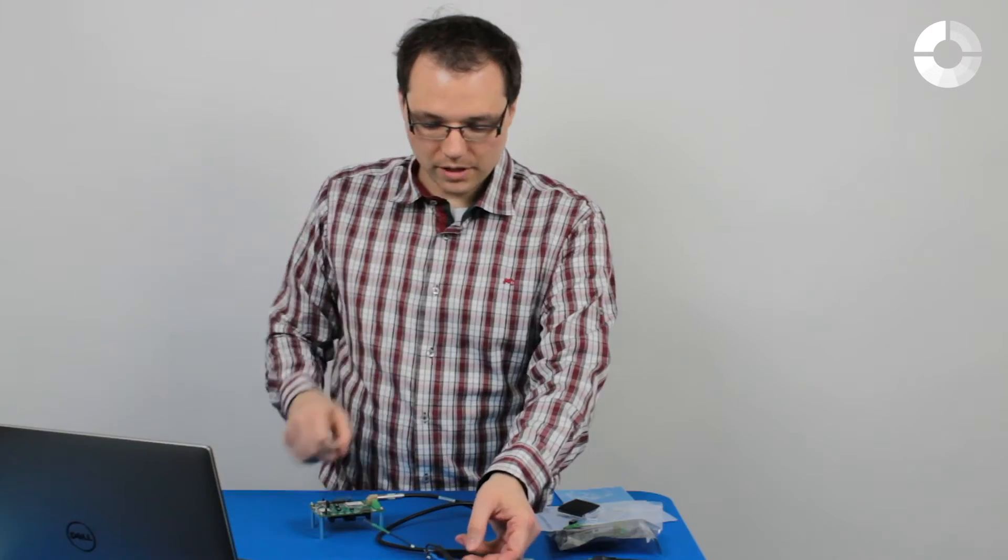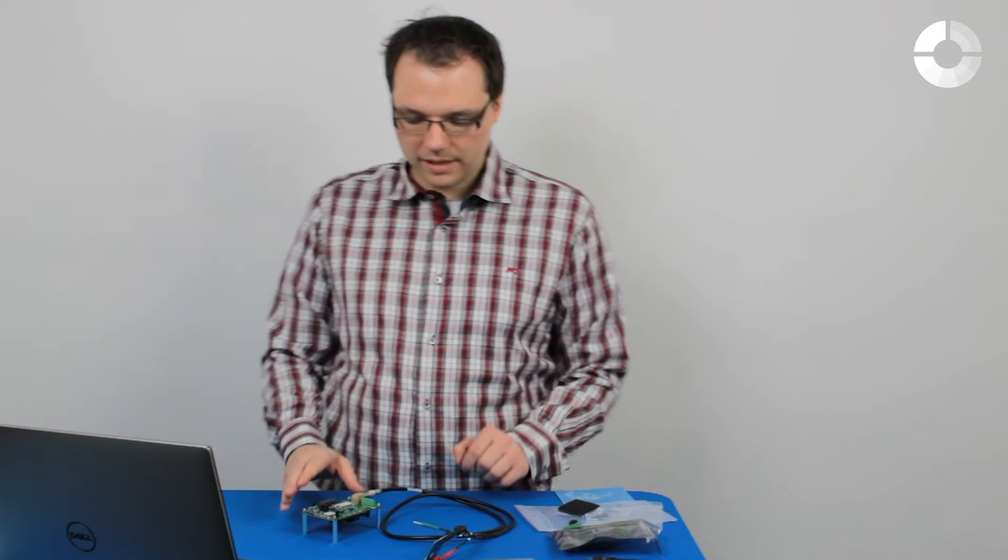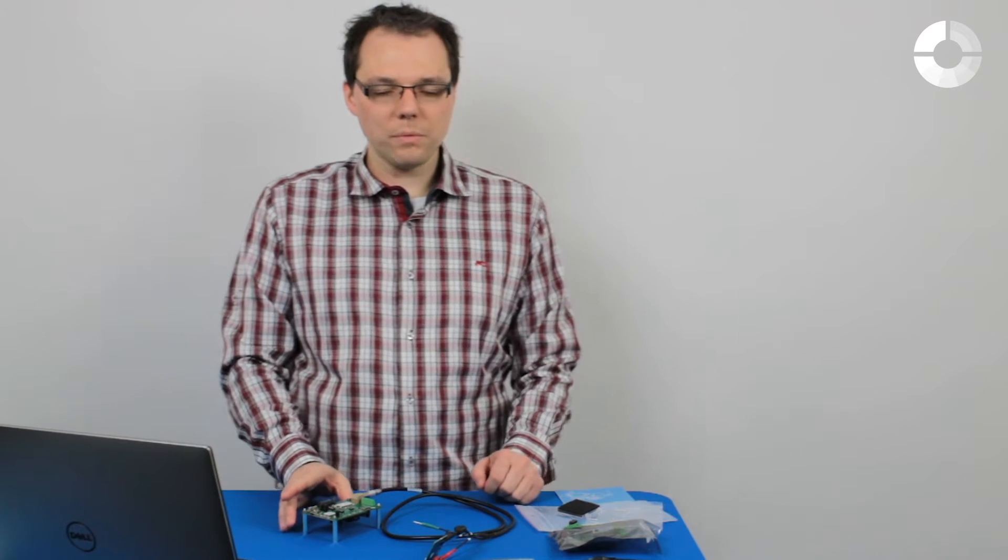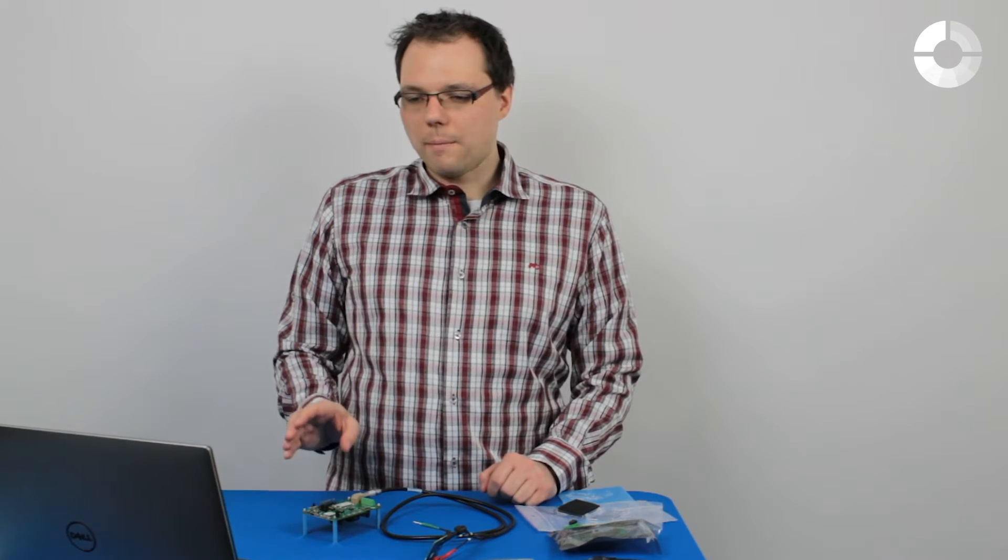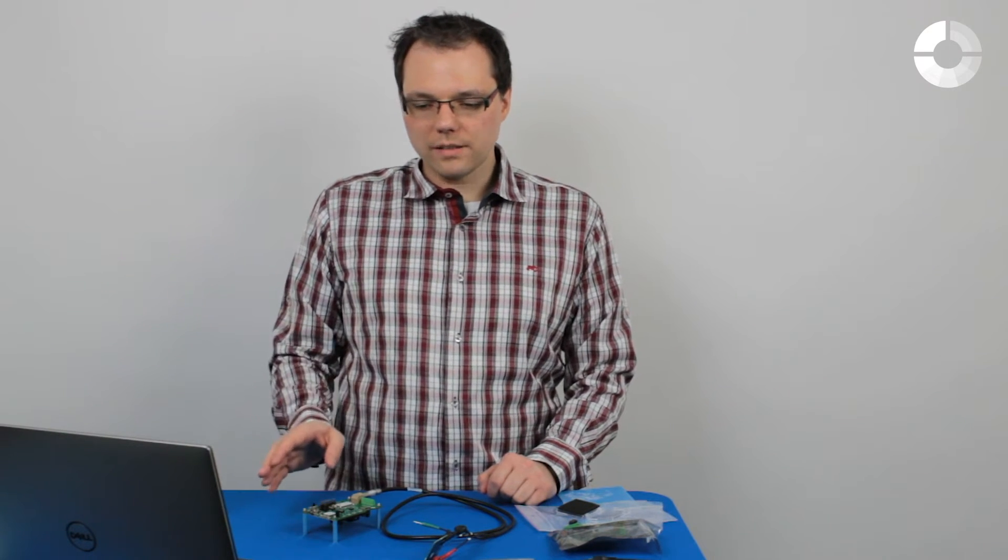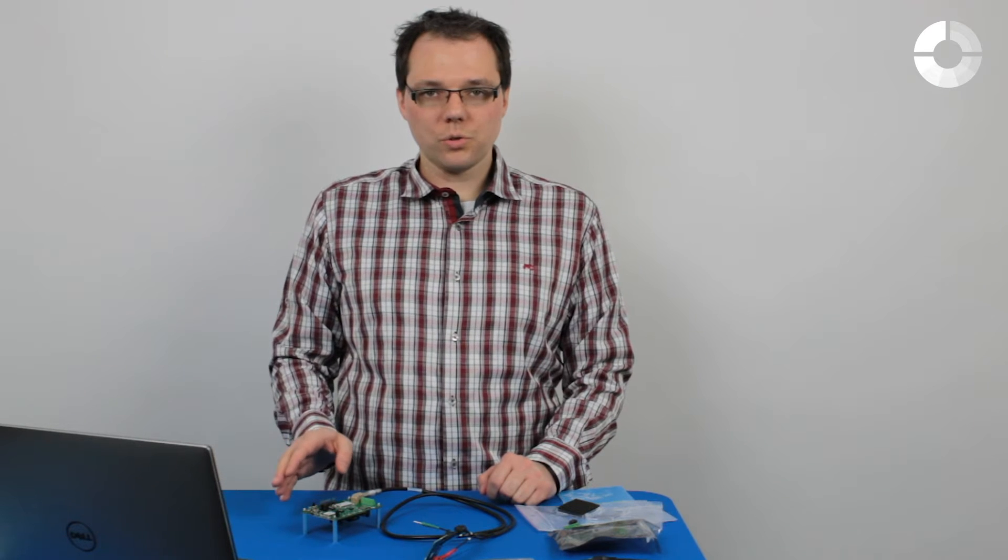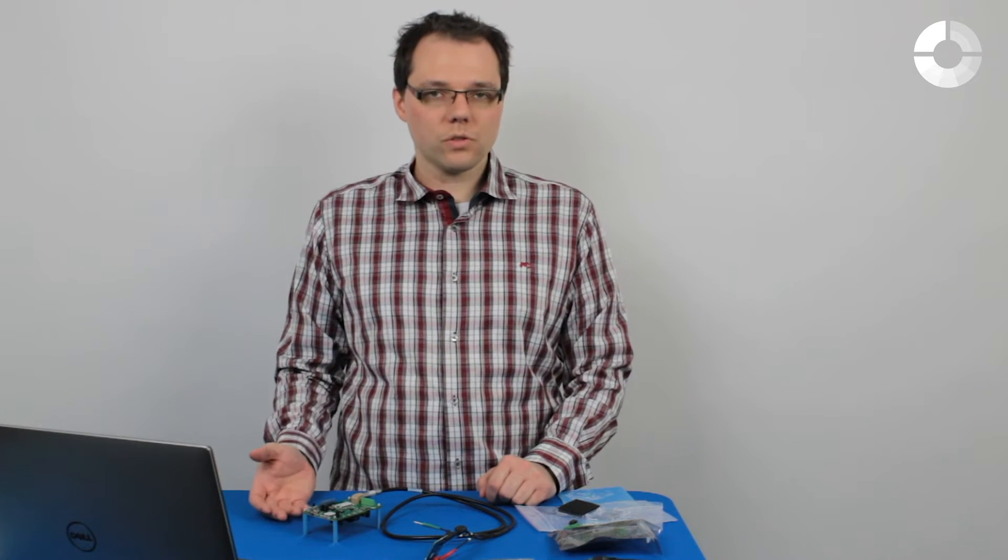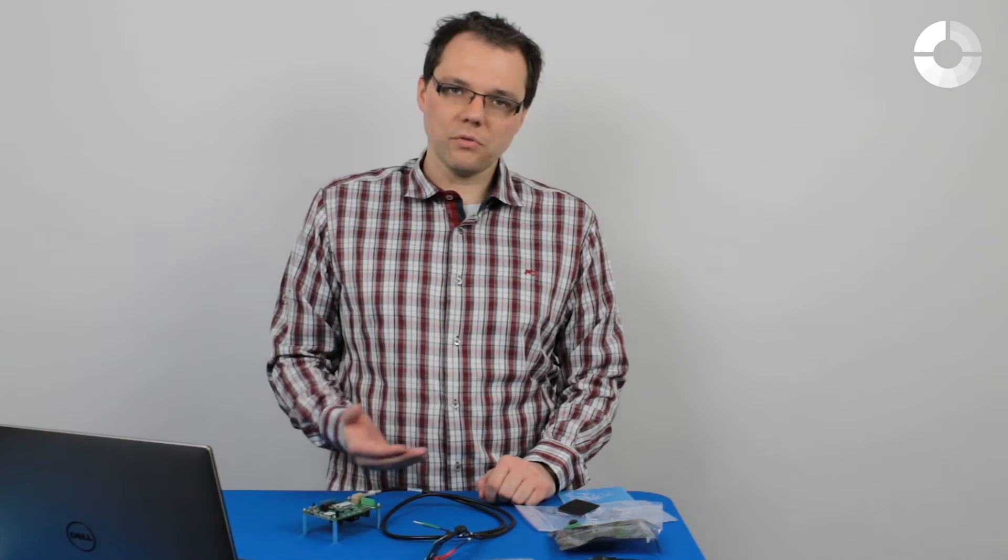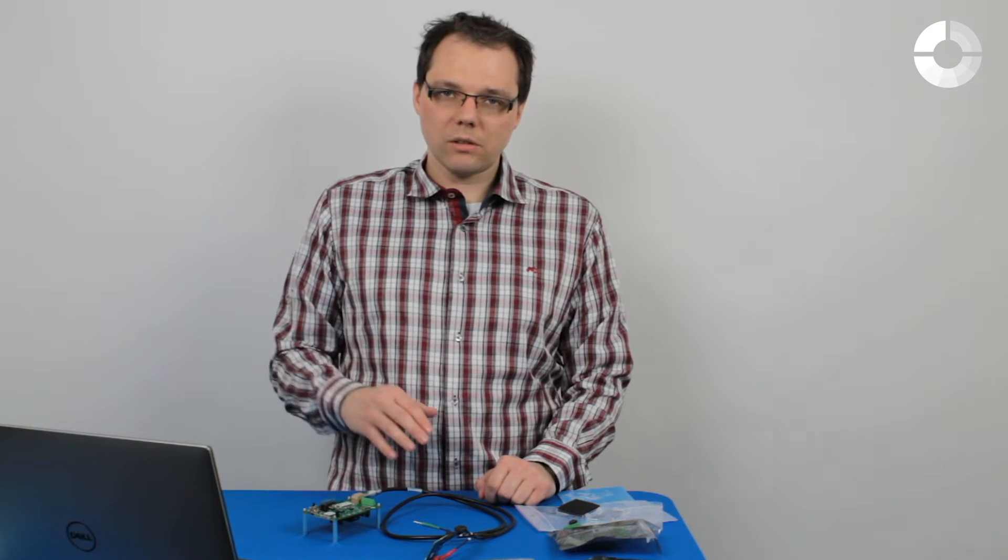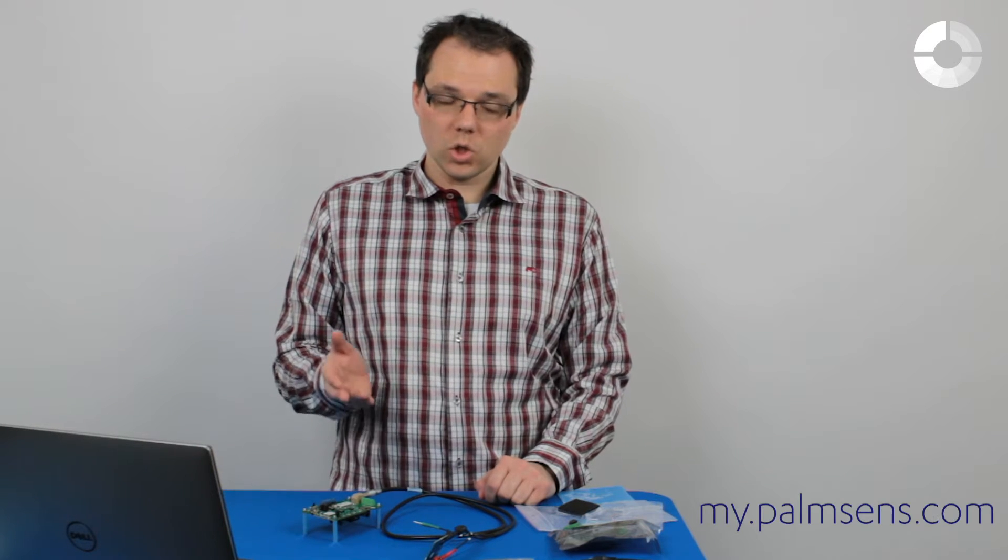So, we have connected our dummy cell and now we want to connect our development board. Before you connect the development board to your Windows computer, make sure you've installed PS Trace. As I said before, you can download it on my.palmsense.com.